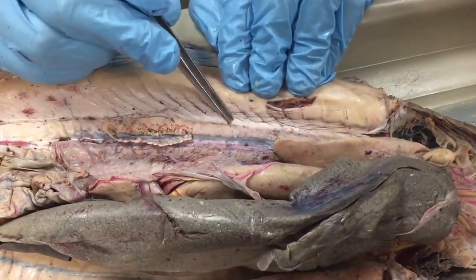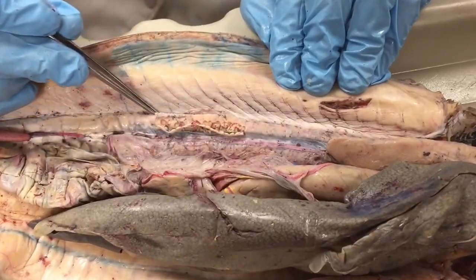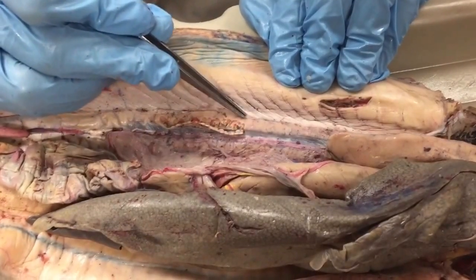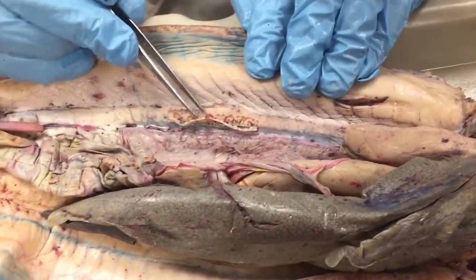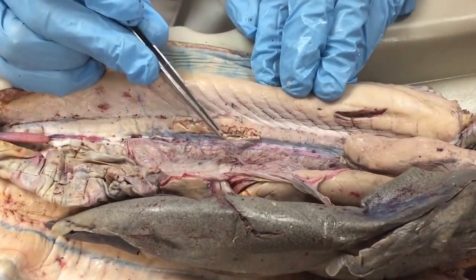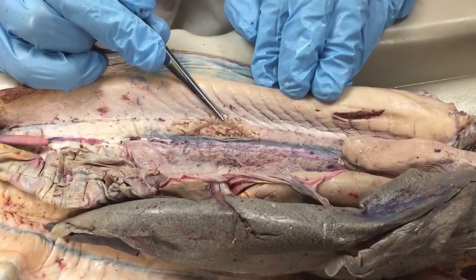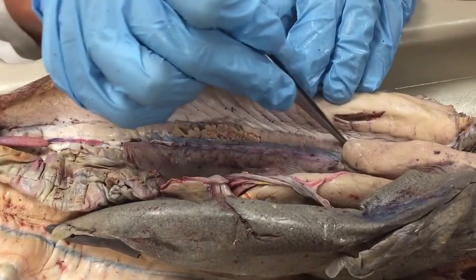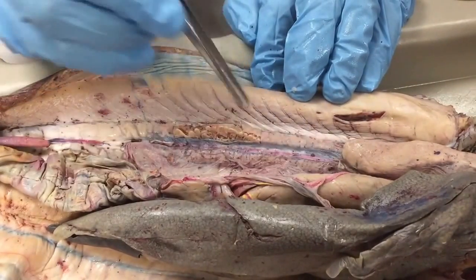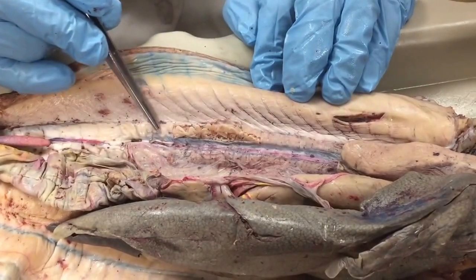So you can actually see, now I cut this little section away. I just cut this little connective tissue, mesentery type tissue off and peeled it back so that you can really see this ductus deferens here. It's just convoluted tubules that look like miniature intestines, right? So it runs the full length on top of the kidney. Here, the ductus deferens is carrying the sperm and seminal fluid down.